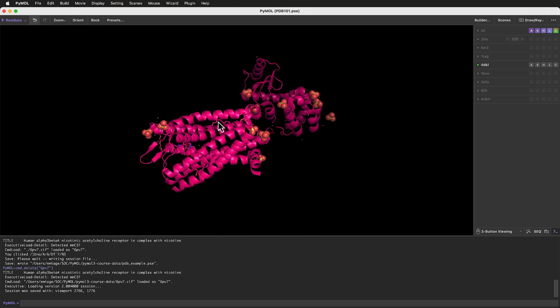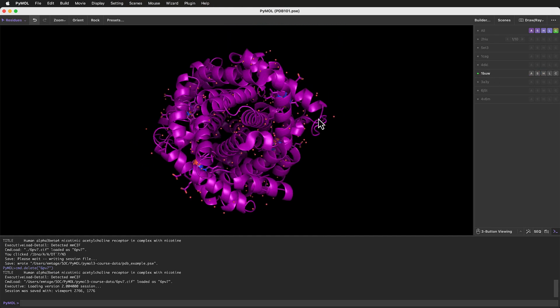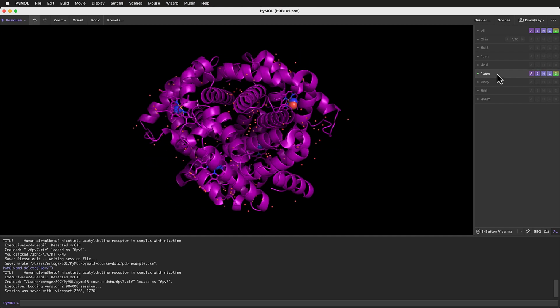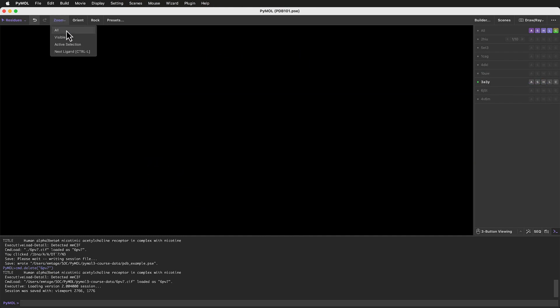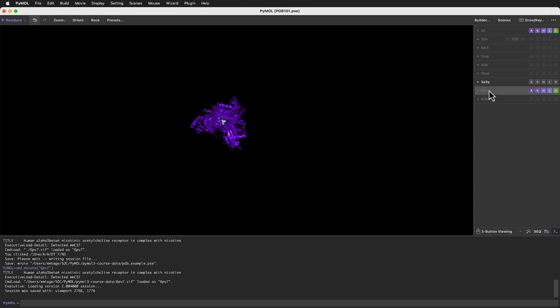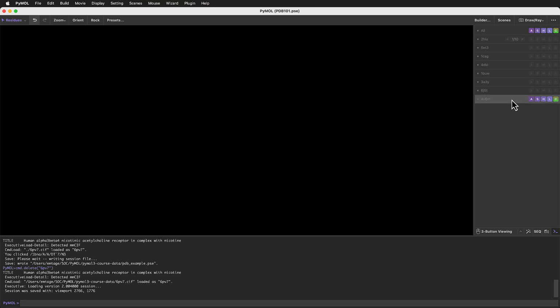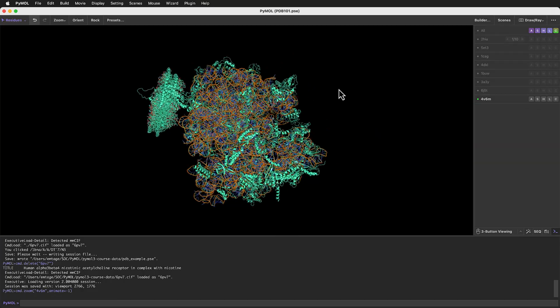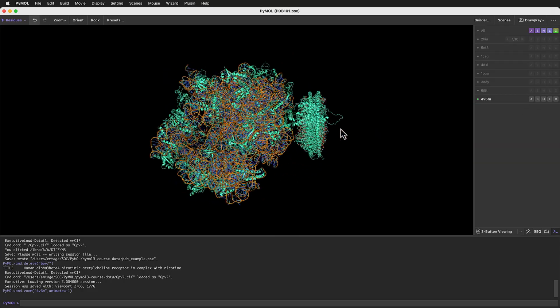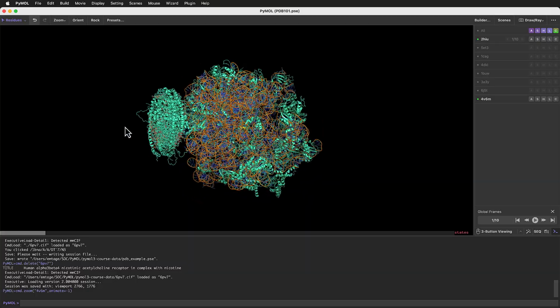If you're new to PyMOL, go ahead and familiarize yourself with the mouse controls, including and excluding each of the structures, zooming in and out, and take some time to inspect things. You could try recreating this session file by downloading each of these structures yourself using the fetch command, and you might also want to test out some of the colouring and representation options from the ASHLC submenus, though we'll cover more about changing the way things look in future videos.